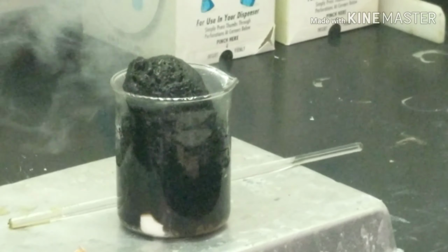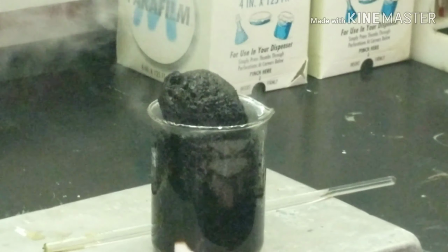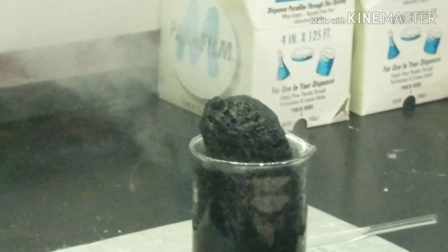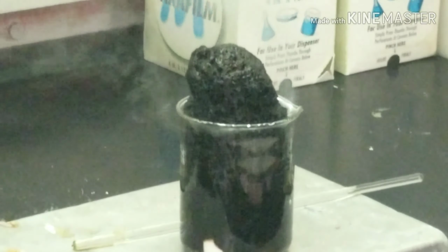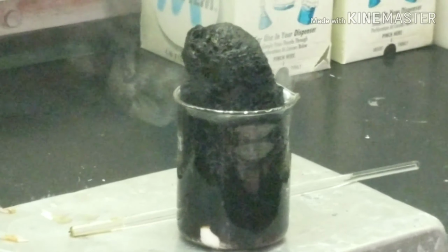Some people say it looks like those snakes you buy at 4th of July. They grow. That's not this reaction, but that is carbon. Certainly this is very hot. I certainly wouldn't want to touch that with my bare hands.